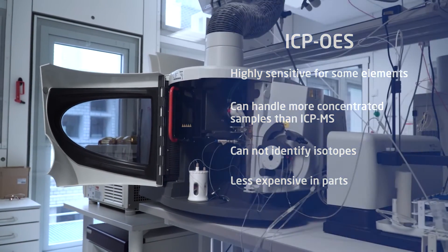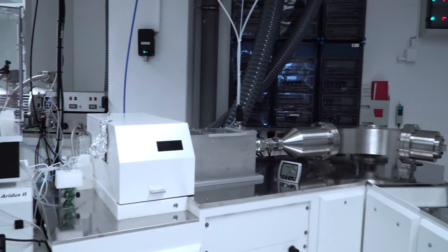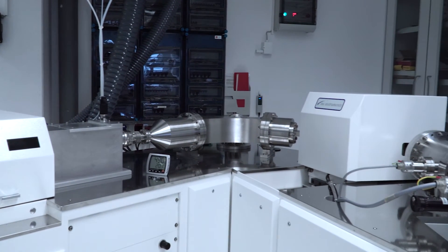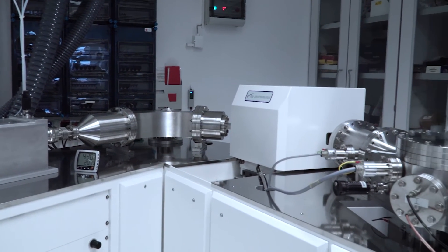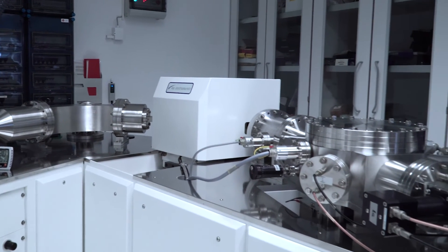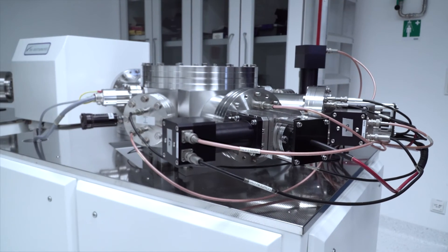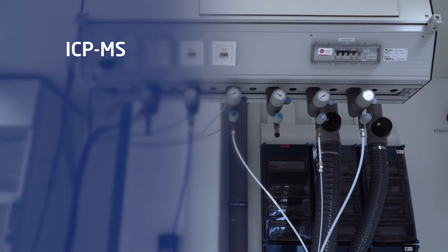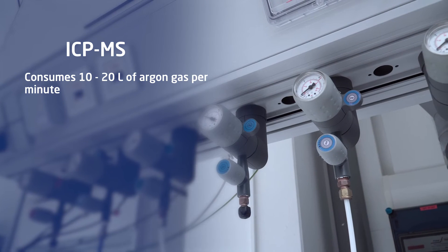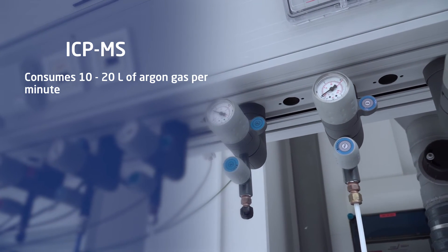The ICP-MS technique can measure extremely small concentrations for some analytes, parts per trillion or even parts per quadrillion. But it is also quite demanding regarding lab requirements. A typical ICP-MS consumes 10 to 20 liters of argon gas per minute.